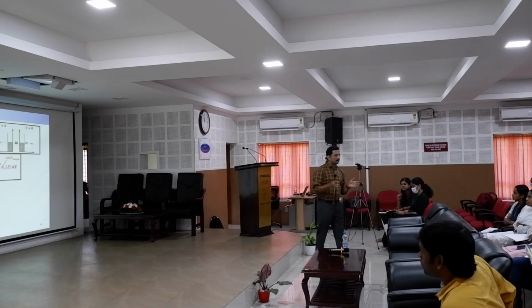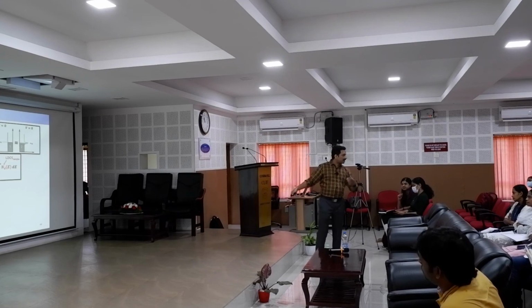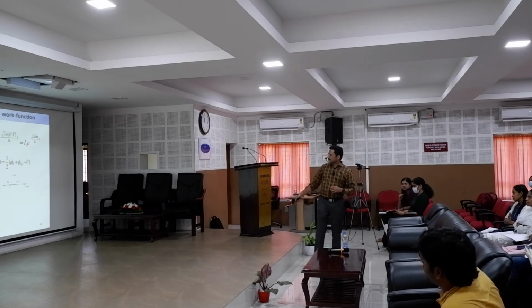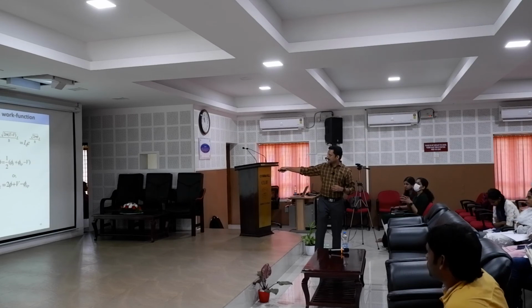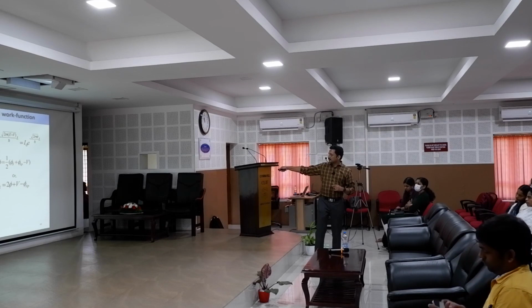Okay, so measurement of density of states we can clearly do depending upon the tunneling current of the instrument through the material. This is what I said, this is called the IV spectroscopy. We just fit here, and this term contains E minus V taken as phi. So basically that E contains half of phi of S, the work function of the sample. This is the work function of the tip.